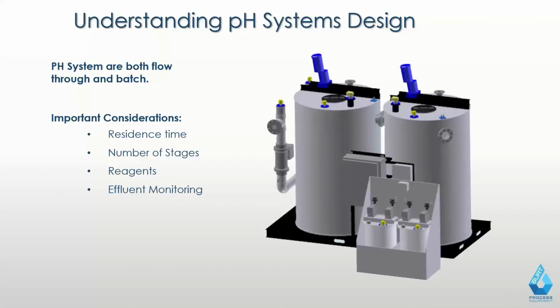Some people like to do drum exchanges, and they use drums in other areas of the facility, and they bring them in like that. So it really depends on owner preference at that point. Regardless, if you use drums, you can't just put them there. They still have to be double contained. They have to go on a spill pallet or in a cabinet. There's a fair amount of handling when you are swapping out drums. My experience is with personnel who use tanks, but there are pros and cons to using both of those. Okay, great, thanks.